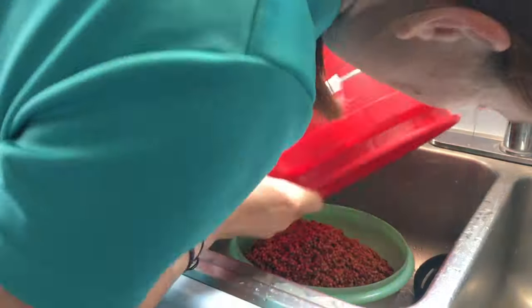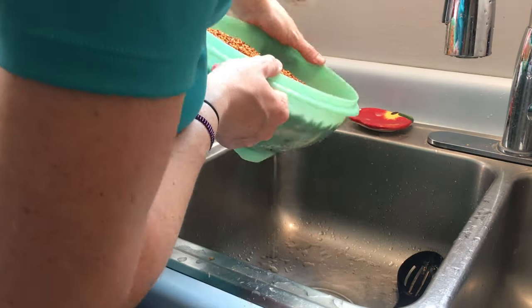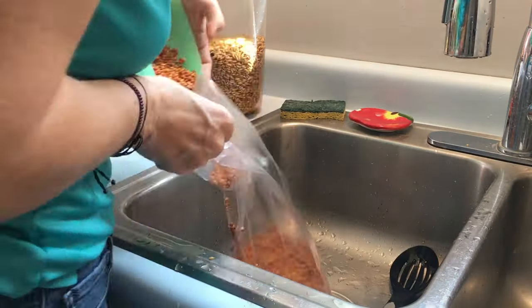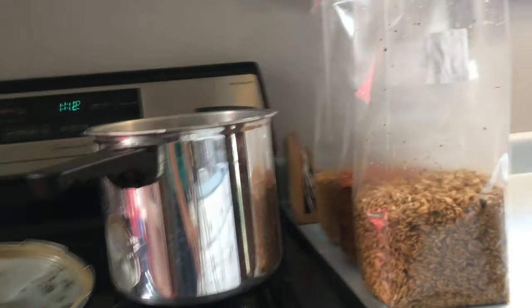Now we need to drain the grain and then fill our spawn bag. Now it's time to sterilize the bag.